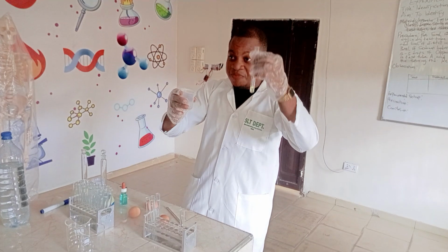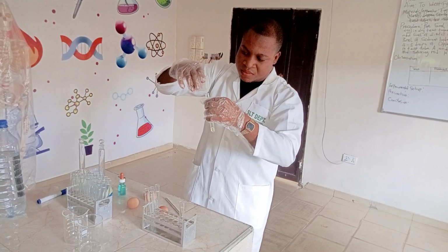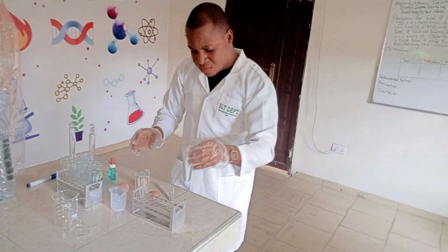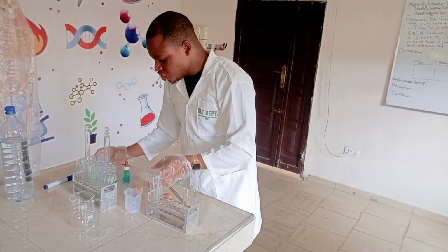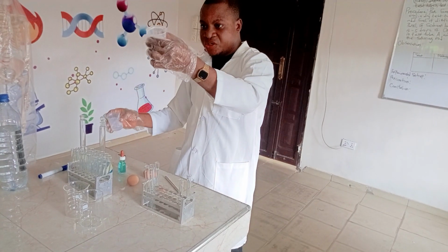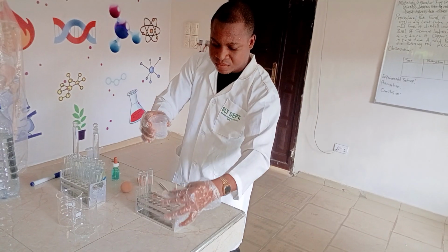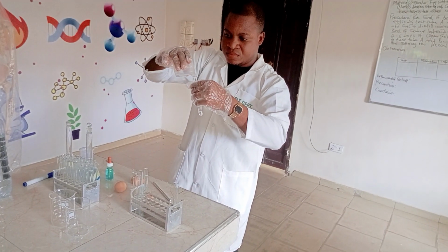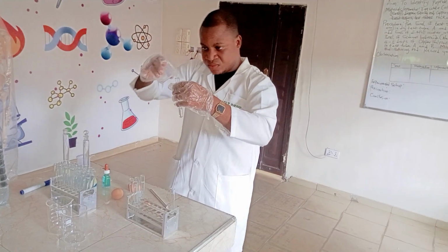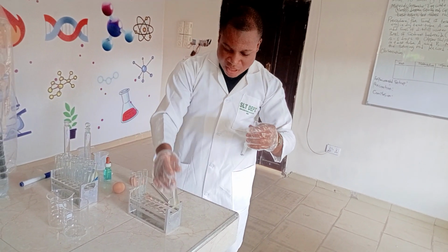This is test tube A, with the egg white. I will introduce it here. I will also introduce 3 ml inside the water also. I've gotten that.